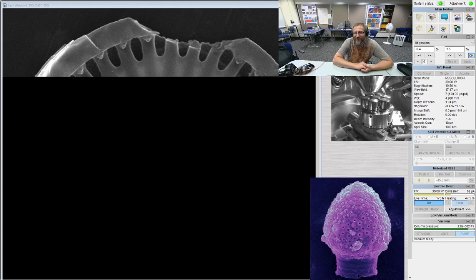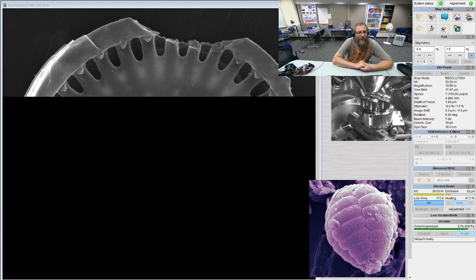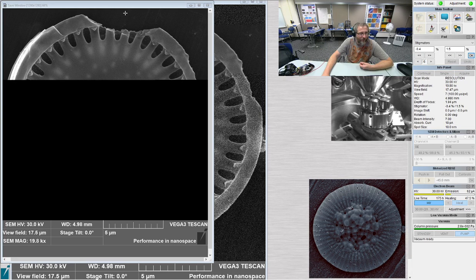Compared with a hair, how big is this one? Well, what is a hair? 100 microns thick. Mm-hmm. And this is about 10. This one is, well, this one's a little bigger than 10. It's probably more like, yeah, that. So you could put 10 of these on a hair. 15, yeah. Or I guess if you want to round the hair, you could put 31.